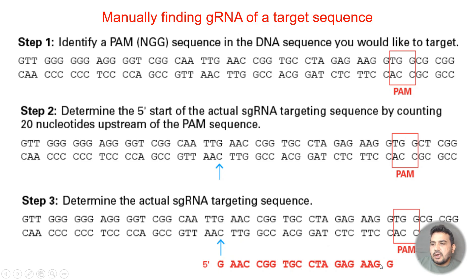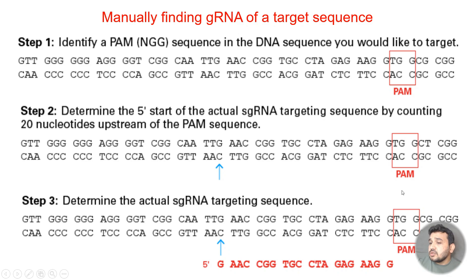That would actually be our guide RNA sequence. Make sure that in the final guide RNA sequence, the PAM sequence is not included. The PAM sequence is important for Cas9 recognition, but it is not finally included in the guide RNA sequence itself. Let me show you a few more examples from databases.